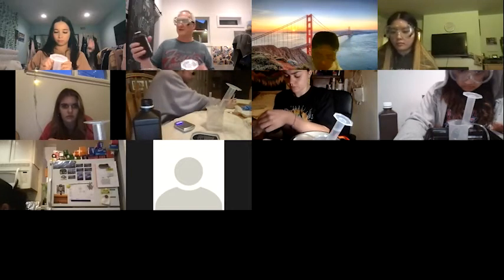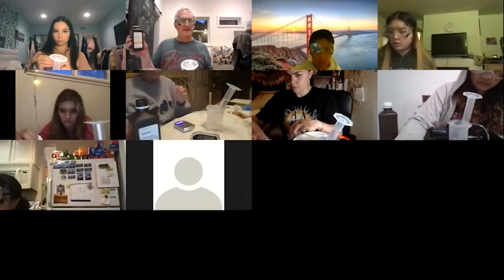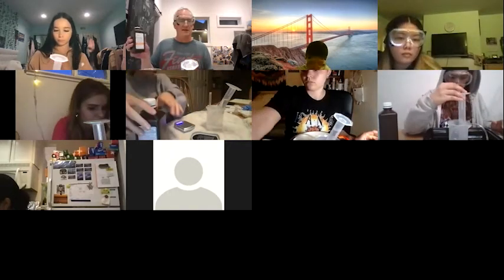Make sure you've got 3%. Sometimes I've seen bottles of 5%. If it's 5%, that's fine, just make sure you notice this. But I think they're all 3%.